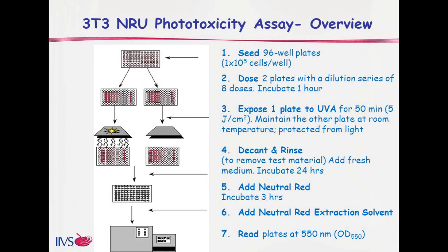Now let's take a look at the general overview of the 3T3 assay. Again, I'm not going to focus on the step-by-step specifics, but if you would like more information, I encourage you to ask your questions as we proceed, and then we can address them during the Q&A session at the end of the webinar. This assay starts with seeding of 96 well plates.